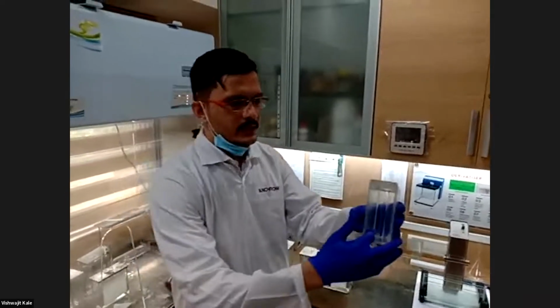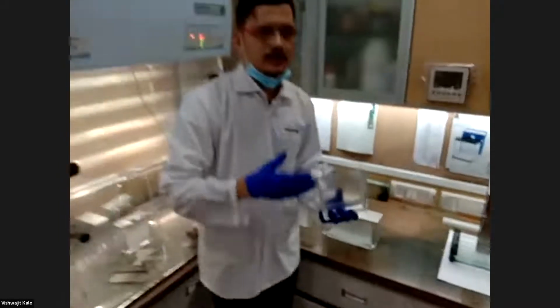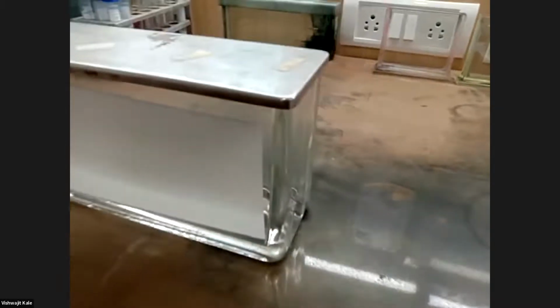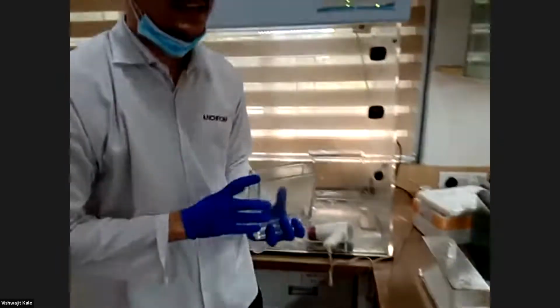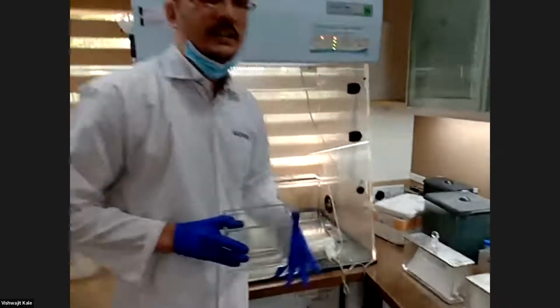That is possible. So there are two troughs inside. One hump is there which will divide this chamber into two troughs. So one trough we are using for chamber saturation and another trough we are using for chromatographic development. So here you can see this is coming in three different dimensions: 10 by 10 centimeter, 20 by 10 centimeter, and 20 by 20 centimeter. For one single plate development, 10 by 10 centimeter plate development, only 10 milliliters of mobile phase is required. For 20 by 10 centimeter plate development, 20 milliliter of mobile phase is required. And for bigger plates, for 20 by 20 centimeter plates, only 35 milliliter of mobile phase is required.